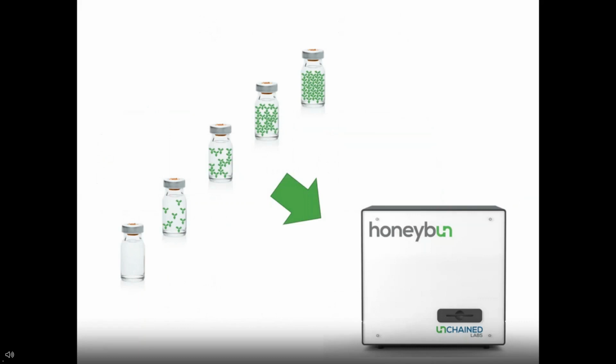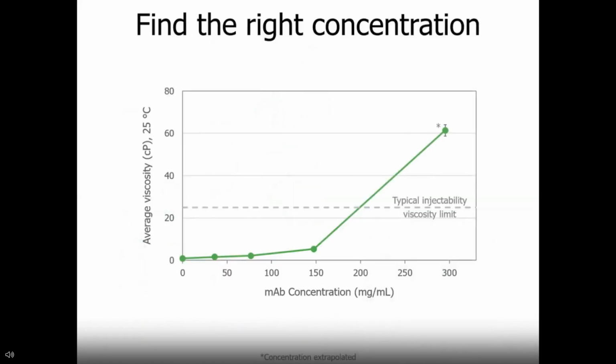So if we take 4 different antibody concentrations and our buffer solution as well and feed those through Honeybun, the results we get look like this, where we have our buffer sample, and then as we're adding more and more antibodies into solution, we see viscosity goes higher and higher, all the way up to our 300 milligram per milliliter sample. And we're crossing our injectability viscosity limit, which is between 20 and 25 centipoise, somewhere between our 150 and 300 milligram per mil concentration.